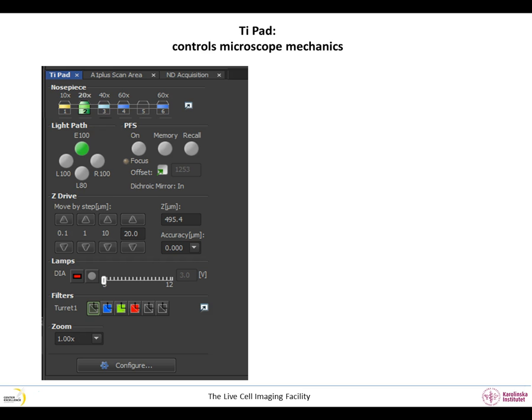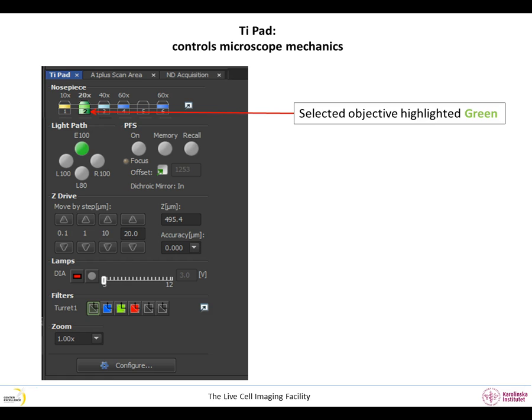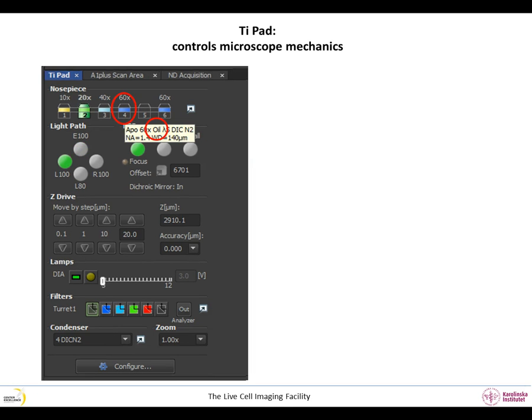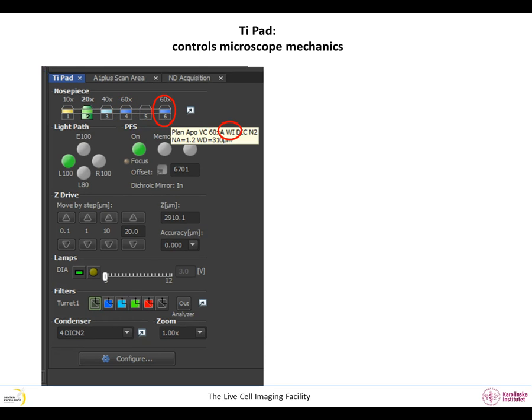The TI Pad tab controls the microscope. This is where you choose objectives. Click on one objective to select it and it will be highlighted in green. By keeping the cursor of your mouse on the objective, you can see its specifications. For example, the 60x objective is an oil immersion objective, whereas this one is specified as WI, which means it is a water immersion objective. Please be careful and use the correct immersion medium when choosing objectives.